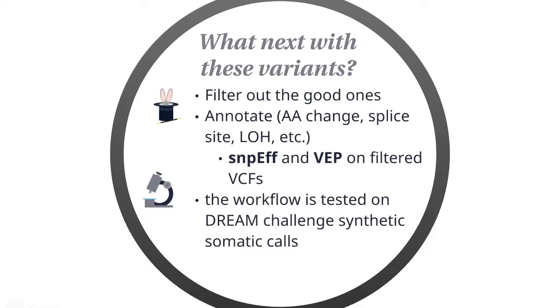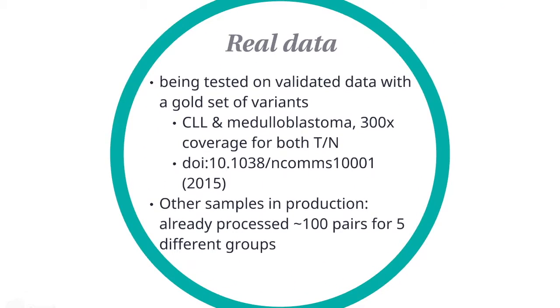This workflow is relatively new, and we tested it on synthetic datasets. Synthetic datasets are good because we know what to expect, but we are also working on testing it on real data, so that we have public data that is available and contains a golden set of variants. And at the moment we are running all the analysis to optimize parameters. For example, what is the optimal coverage, what are the optimal filtering parameters.